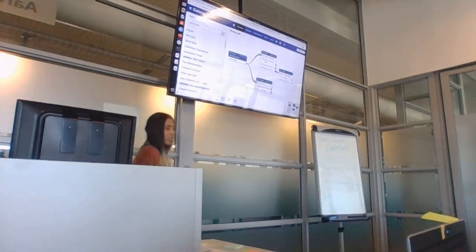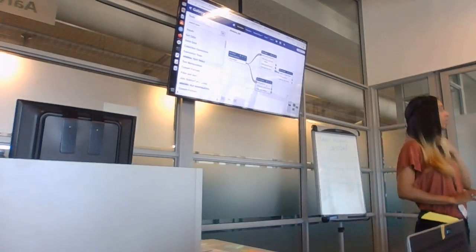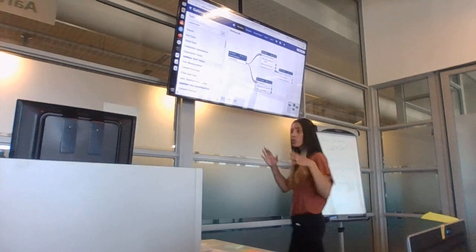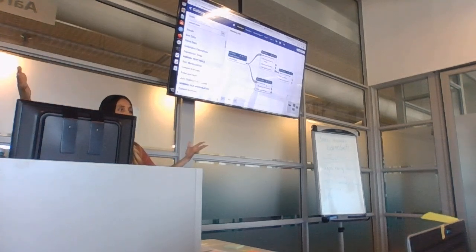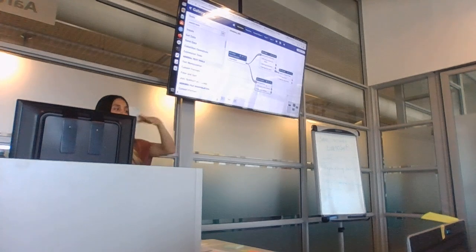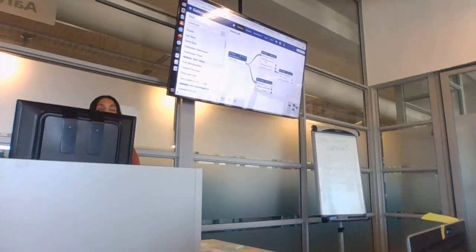Again, this is not accurate because this is taking in the data collection, whereas you want an individual file, but this is just to show you how you can, if you've done your workflow and saved it, and you realize afterwards, oops, there's a step that I forgot in between two tools or at the end, add all of the tools afterwards, including changing the parameters if you found out that you've put in the incorrect parameters, or you're no longer taking a data set, but you're taking a single file. You could change all of the stuff that you previously set.